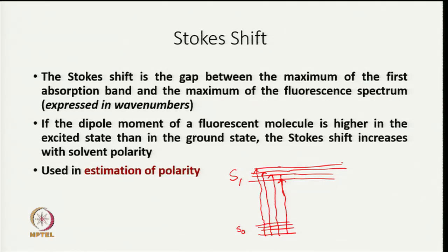But before coming back to the ground state, all of these will come back to the lowest vibrational level of the S1 excited state and then fluorescence takes place. This is the way fluorescence happens.